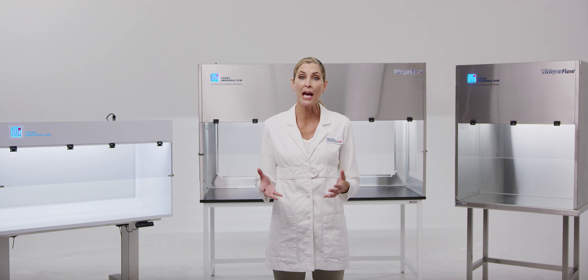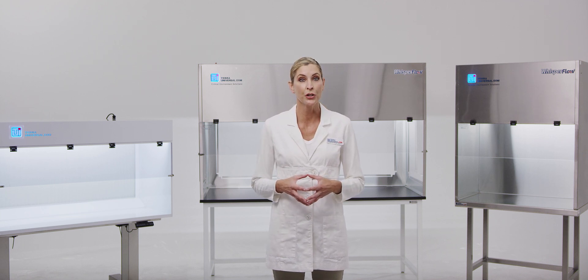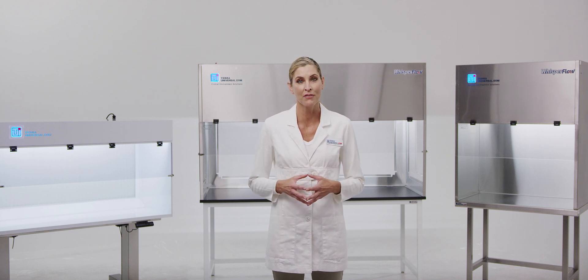All benchtop hoods are compatible with Tara's broad selection of UL listed fan filter units rated for five years of continuous 24-7 operation.